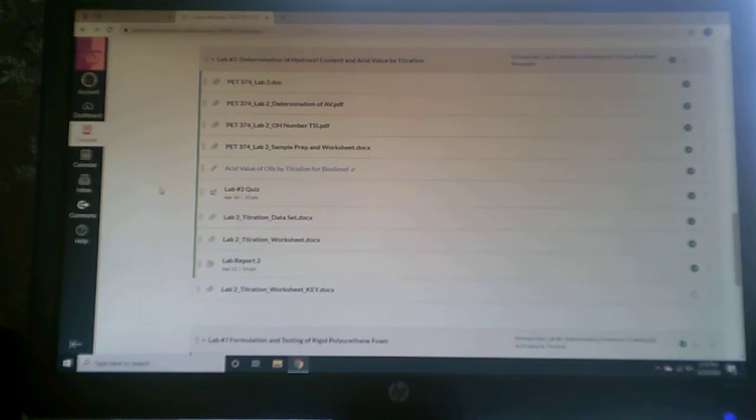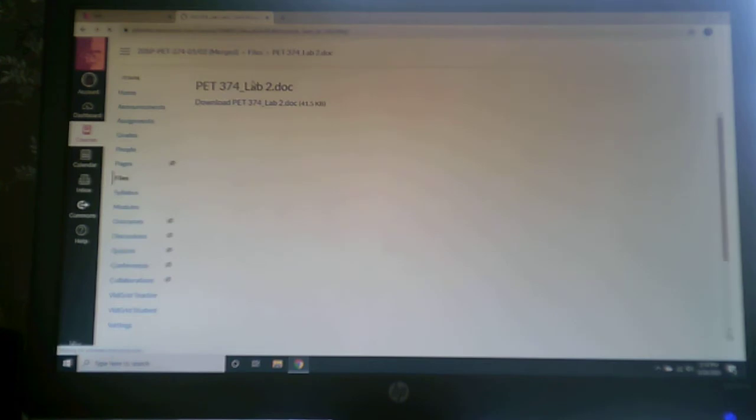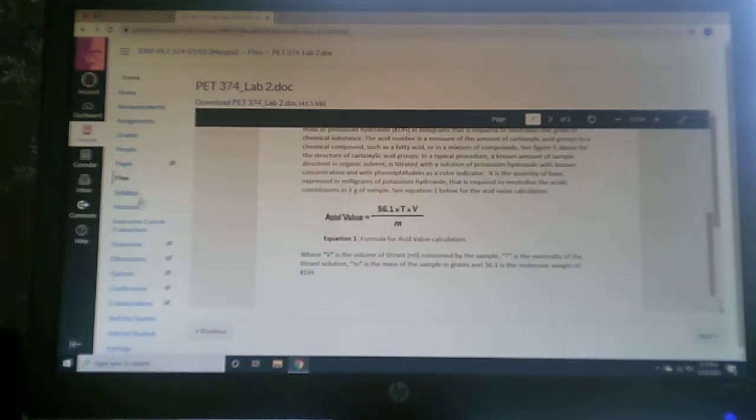Welcome to the brief lab overview video for lab number 2, determination of hydroxyl content and acid value by titration. Your quiz will cover what is present on your lab number 2 handout. So all of the information found here.